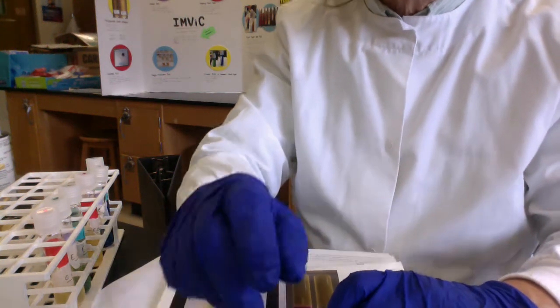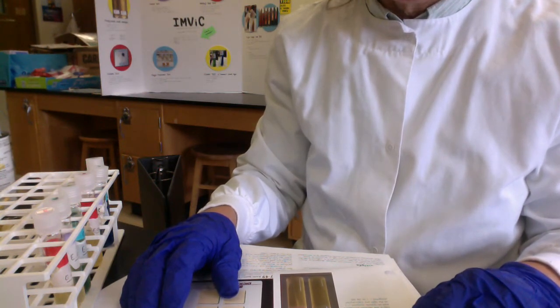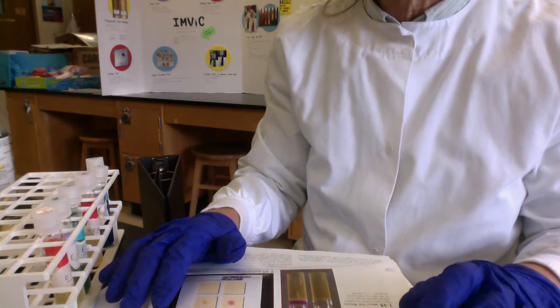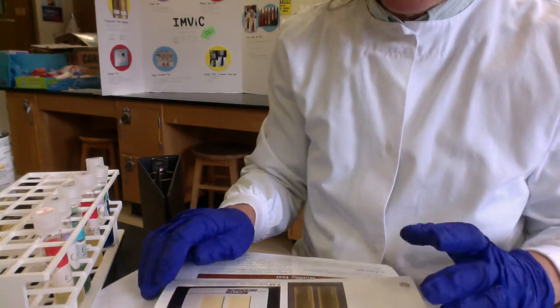Hi micro folks, we are doing chapter 17 metabolic tests part 2 results. In this video we'll do IMViC results, then we'll do another video for the TSI and a last one on catalase. So folks, again, it's really helpful if you can read the lab manual chapter 17.